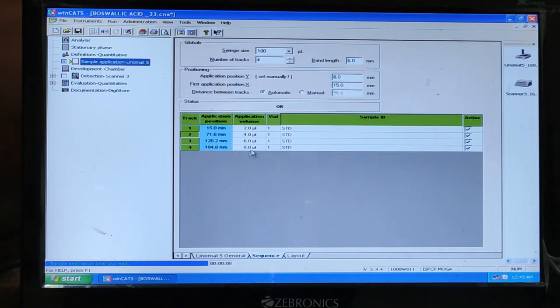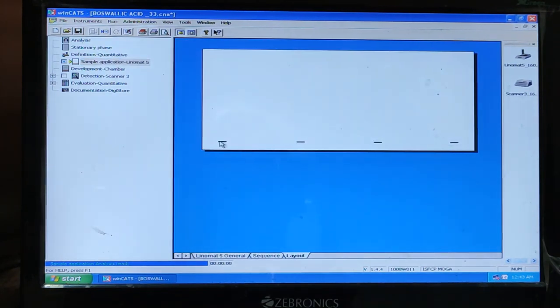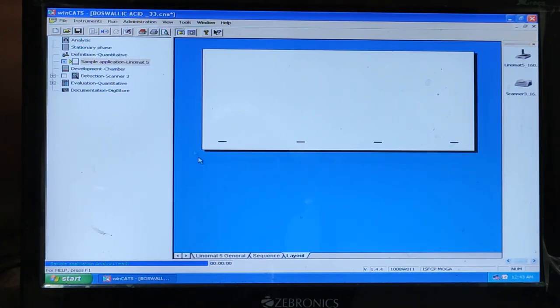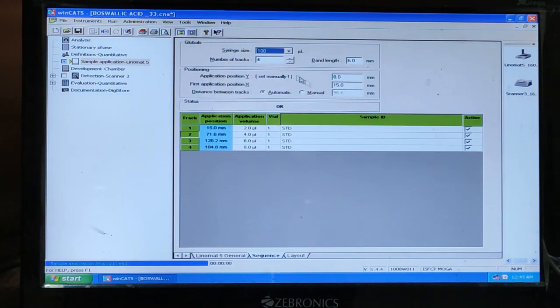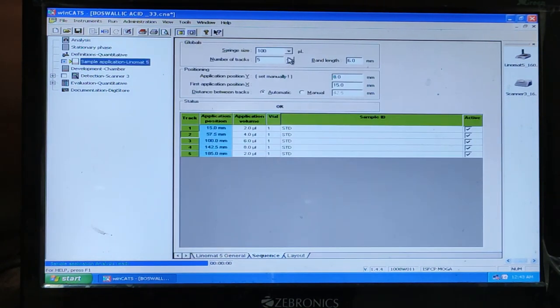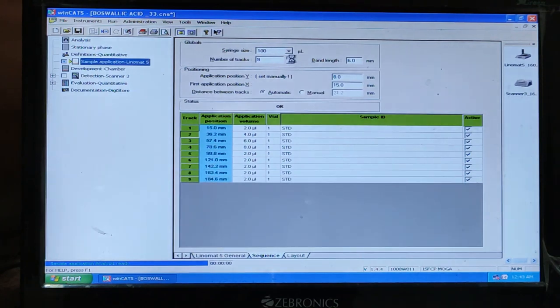You see. So 1, 2, 3, 4. This is number of band means number of track 1, 2, 3, 4. So you can change as per your requirement.